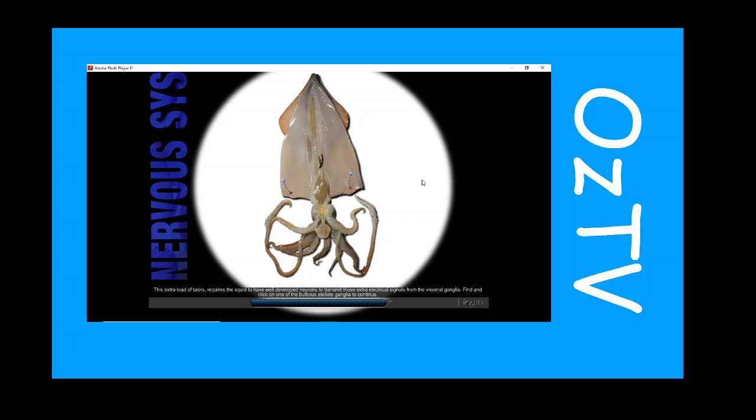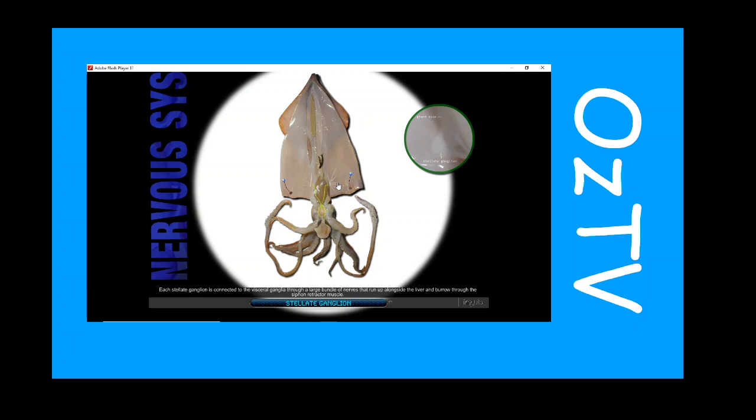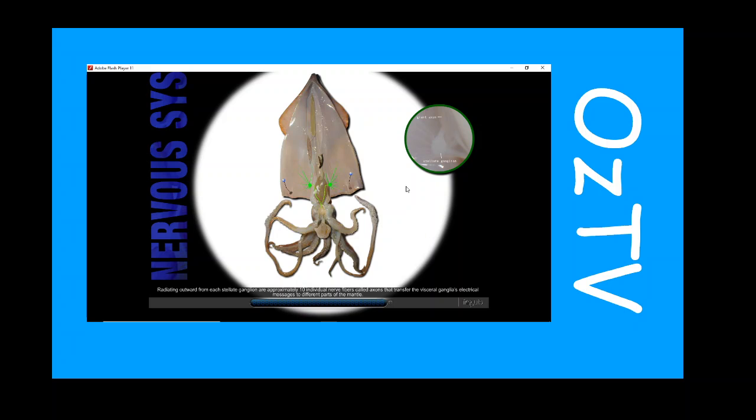Find and click on one of the stellate ganglia to continue. Each stellate ganglion is connected to the visceral ganglia through a large bundle of nerves that run up alongside the liver and burrow through the siphon retractor muscle. Radiating outward from each stellate ganglion are approximately 10 individual nerve fibers called axons that transfer the visceral ganglia's electrical messages to different parts of the mantle.